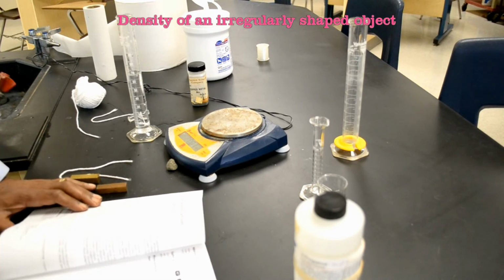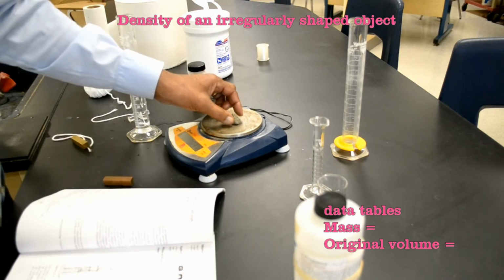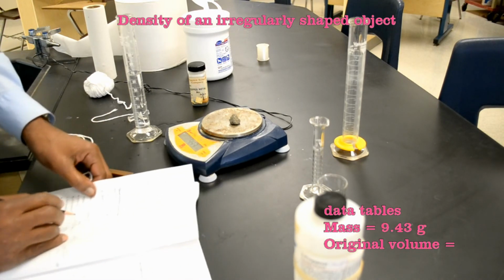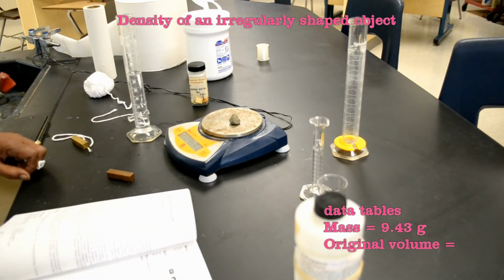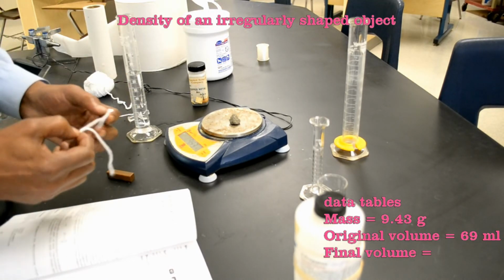Okay, number 5. Repeat steps 2 and 4 with two different irregularly shaped objects. The mass of the rock, the first irregularly shaped object, is 9.43. The original volume in the graduated cylinder is 69 milliliters.